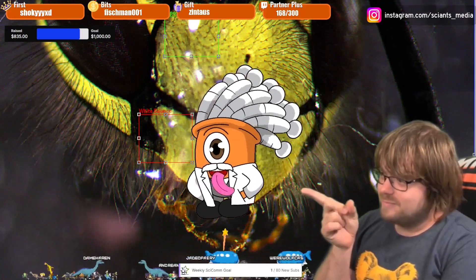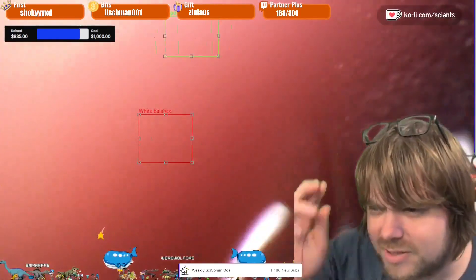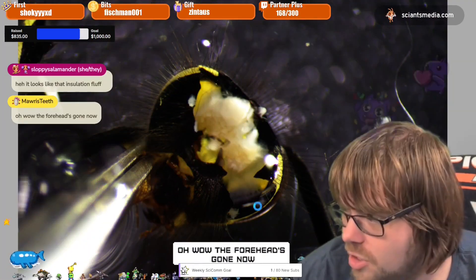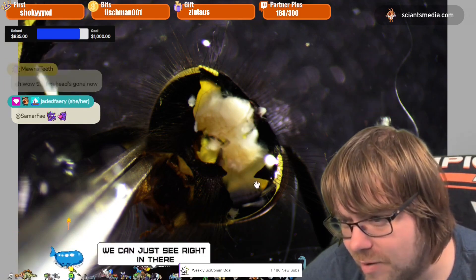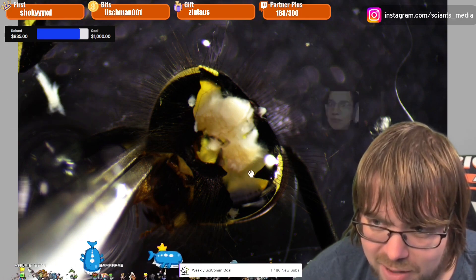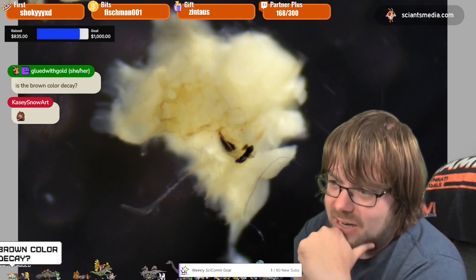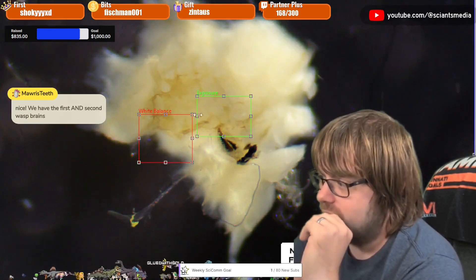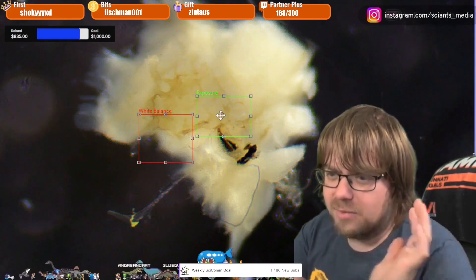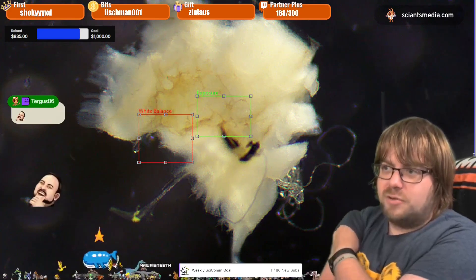What I'm doing now is peeling away the exoskeleton - I just want to show you all something. This brain has started to decay; it was put into alcohol after it had already died. I just took off the exoskeleton and you can see it's already coming apart - it's probably going to break up, so when we pop it out I don't think it'll come in a solid piece. Right here you can see that near see-through tissue - that is the optic lobe, all touching the retina, all eye tissue. The brown is some necrosis - cell death that occurred before it was preserved - and it's fluffier and less see-through because those cells had already started dying.